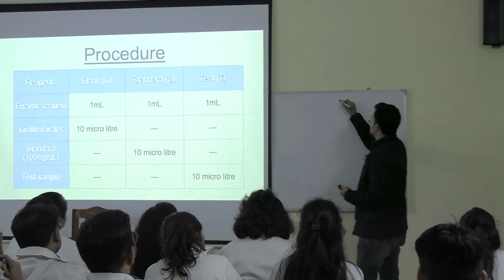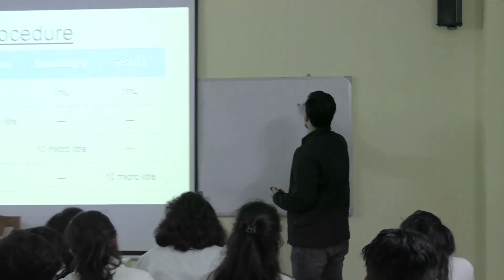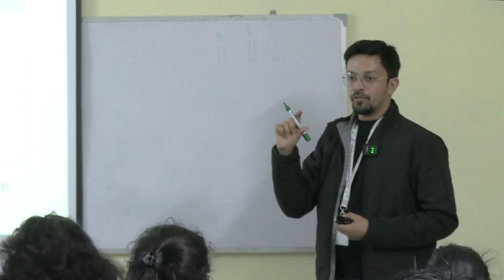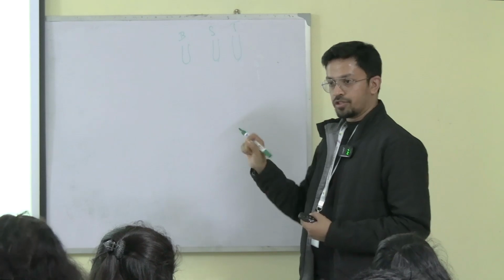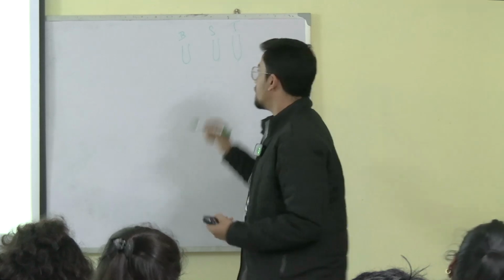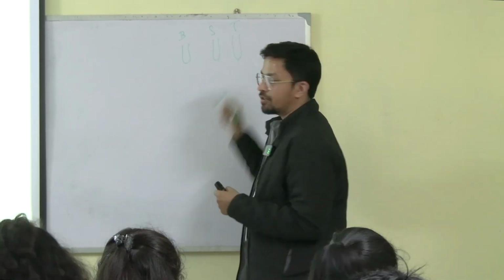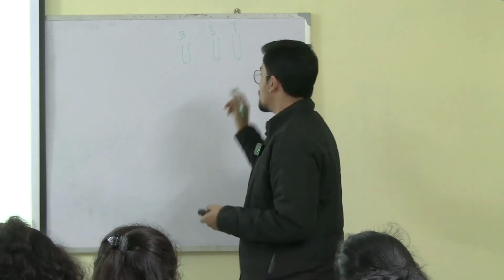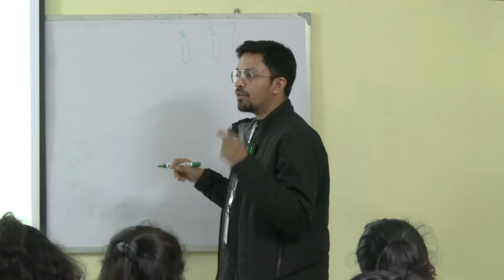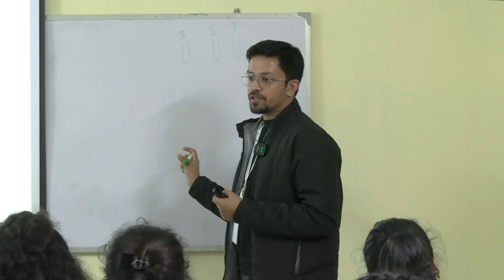Okay. Now you have 3 samples B, S and T in the test tubes, right? Now from the colorimeter you know that it has a specific cuvette where the length is also fixed for each of the cuvettes, right? Now you will transfer these samples into the cuvettes. This B will be transferred to 1 cuvette, S will be transferred to 1 cuvette and T will also be transferred to a third cuvette. Now you will put the cuvettes in the colorimeter. The same way you have put your KMnO4 sample, the same way you will put these samples. Okay, and see the absorbance.